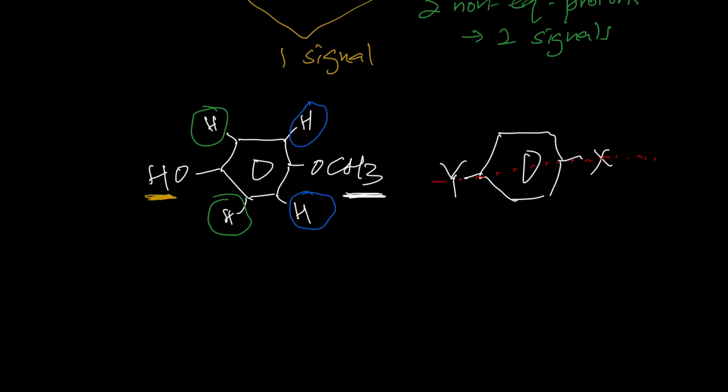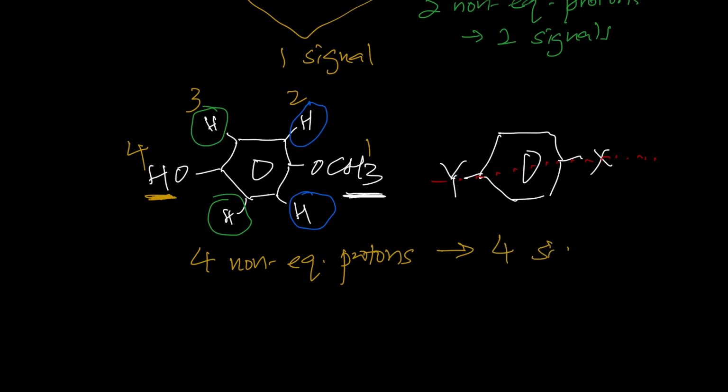So in total, for this aromatic compound, you have 1, 2, 3, 4 non-equivalent protons. You have 4 types of protons. It'll give you 4 signals.